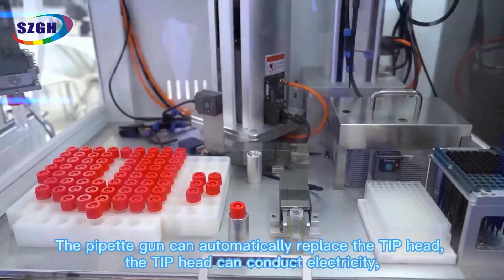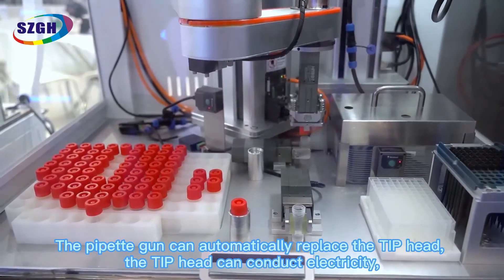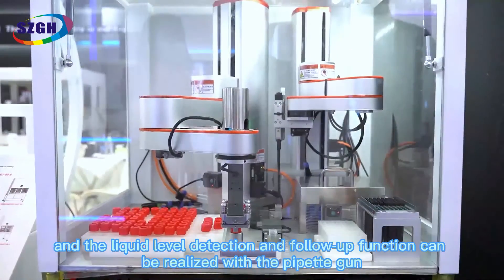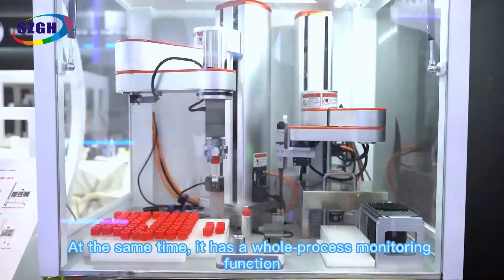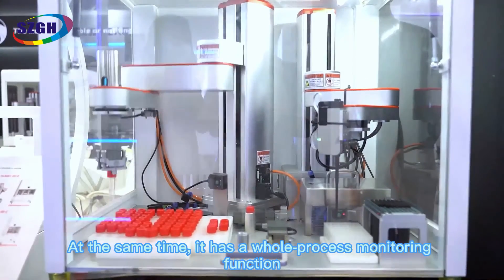The pipette gun can automatically replace the TIP head. The TIP head can conduct electricity, and liquid level detection and follow-up functions can be realized with the pipette gun. At the same time, it has a whole process monitoring function.